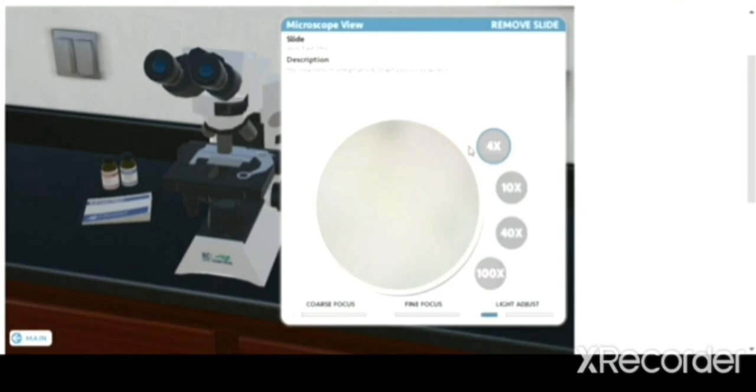The final step of acid-fast staining is to apply a counterstain. Usually it's methylene blue. This counterstain renders non-acid-fast cells blue, while the acid-fast cells remain red because they still have all of this carbol fuchsin.